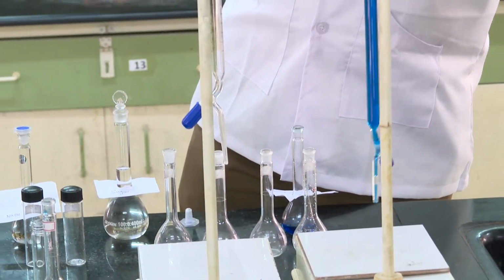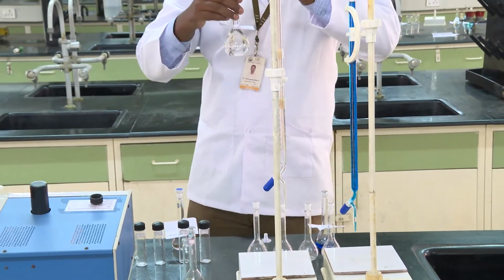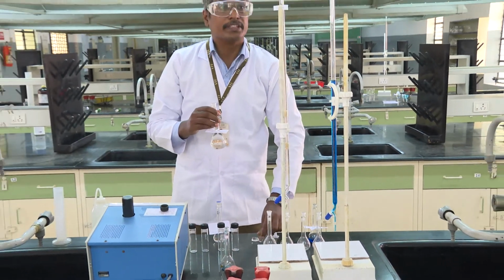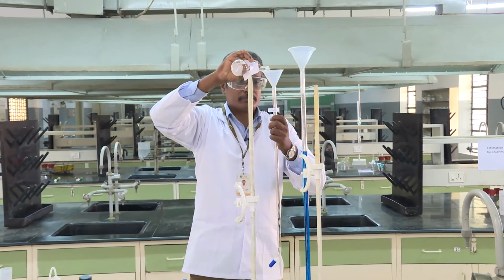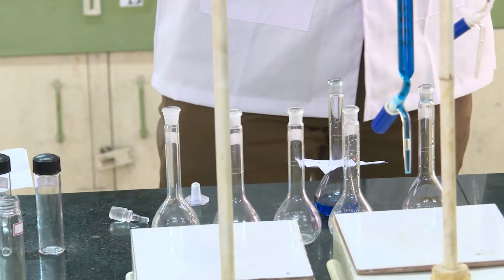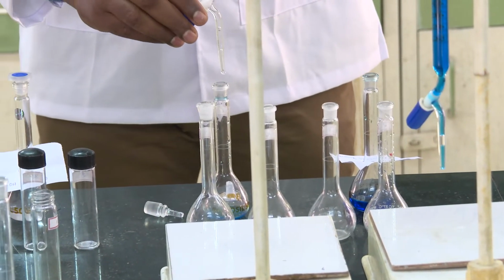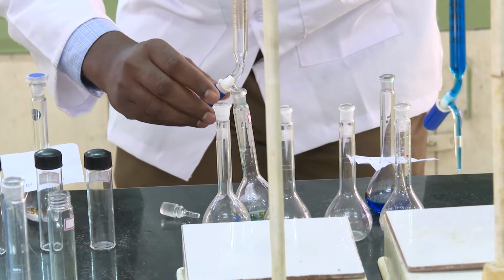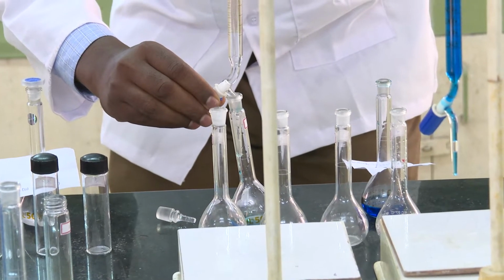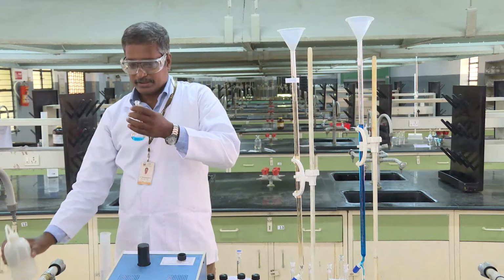Then we need to add 4.5 ml of glucose. So the sugar solution is here, so we can use the other burette for this sample 1 sugar solution, 4.5 ml.